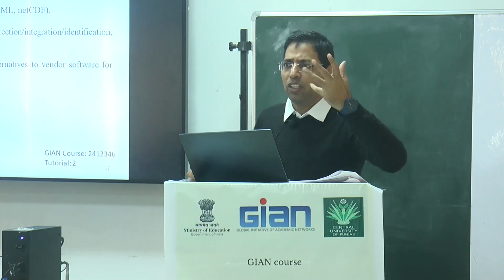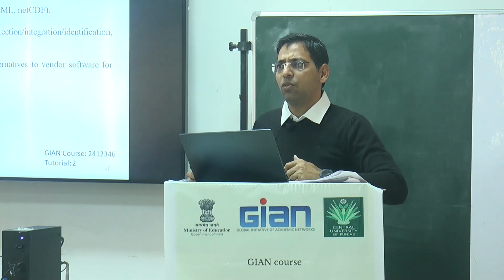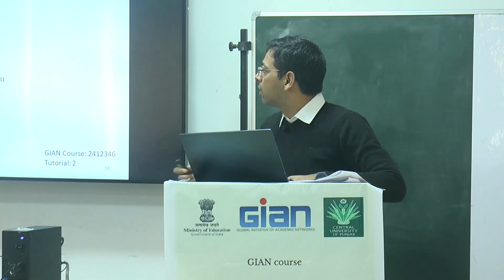If you have the raw data, and if some machine is doing it, they can do it. If they are not able to do it, then you can do it by using OpenChrom.